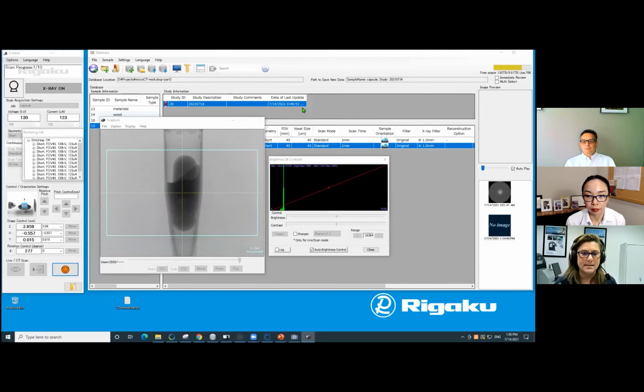So I think I missed that artifact. I'm not sure exactly what it was. So I think I saw it a little bit. Yeah, especially when you do a fast scan, when you're not moving the detector to get rid of the ring artifacts, it's most pronounced at the center. And yes, it could show up like a kind of noisy line in the center, vertical line.